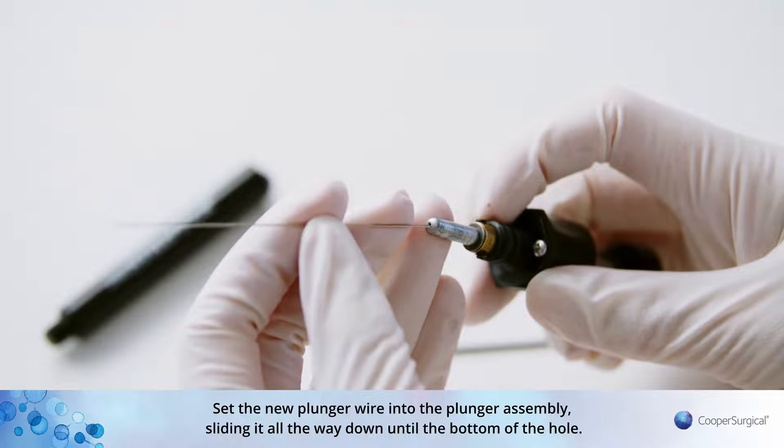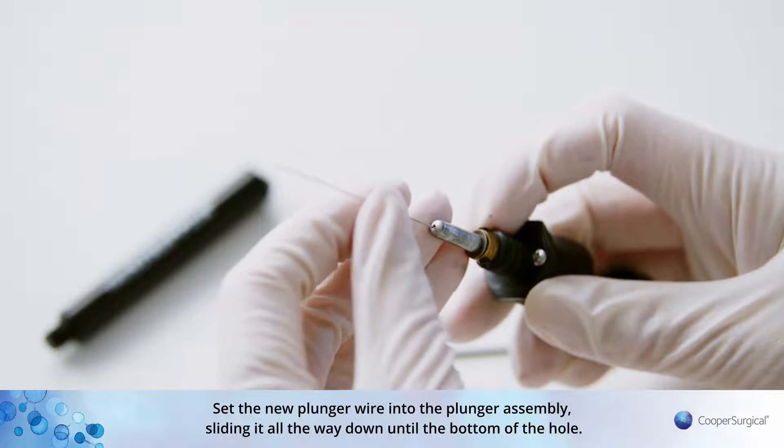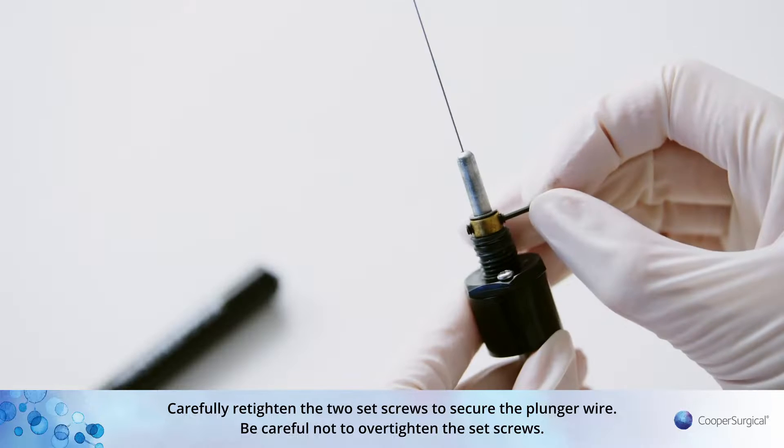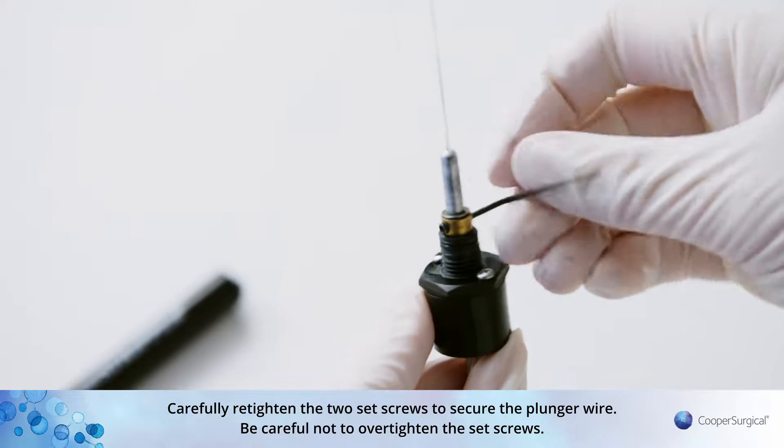Set the new plunger wire into the plunger assembly, sliding it all the way down until the bottom of the hole. Carefully re-tighten the two set screws to secure the plunger wire. Be careful not to over-tighten the set screws.